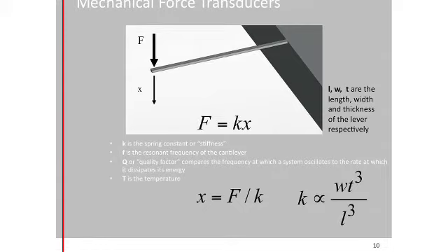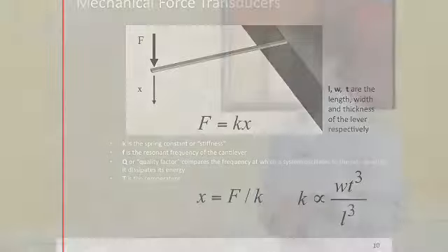So it turns out you probably will want to make something that's really, really long and narrow, and that will give you the lowest spring constant. So that's quite intuitive. If you think about the problem a little bit harder, most of these experiments are actually measuring extremely tiny forces that are on the level of thermal fluctuations, even around thermal fluctuations of this cantilever, even when the cantilever is cooled down to like 1 or 2 degrees Kelvin.